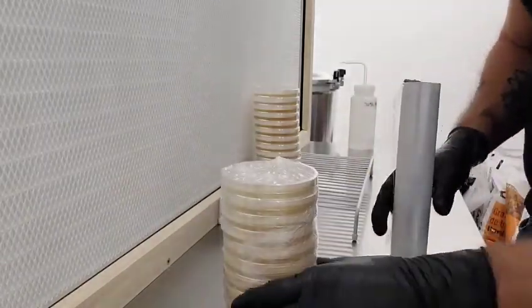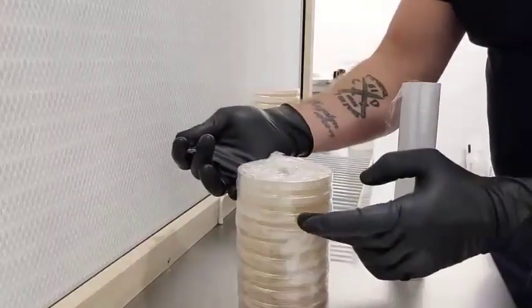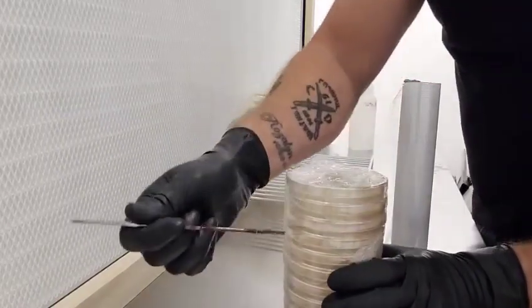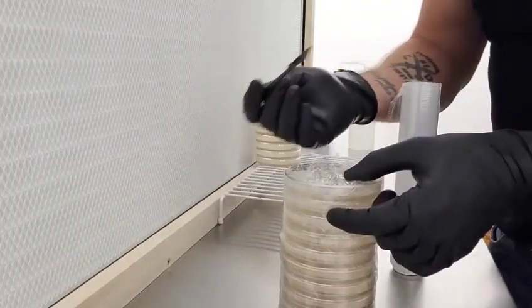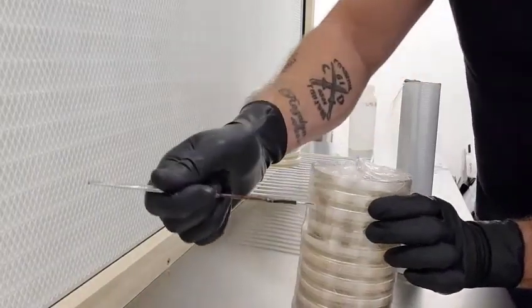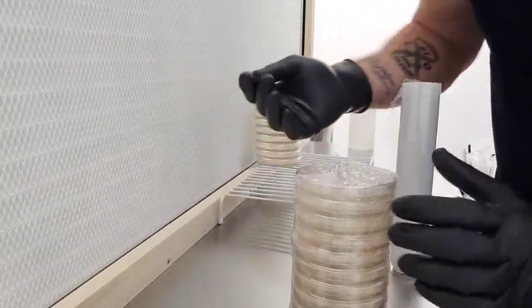Now, when you want to use these, you just use your scalpel. Choose how many dishes you want — you can take one off, you can take many off. Insert your scalpel underneath whatever one you want and just spin. When you lift off however many you want to use, be sure to keep your scalpel under the front of the last plate, or else the last plate will fall off.